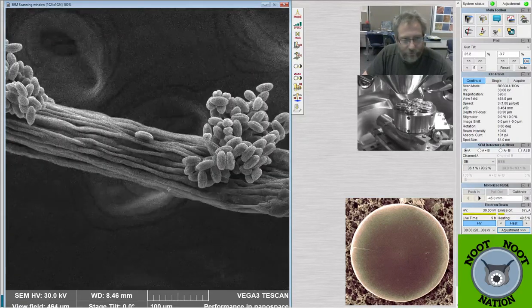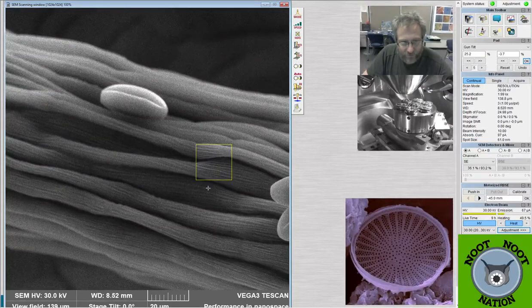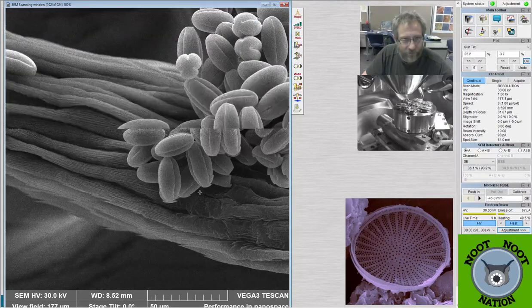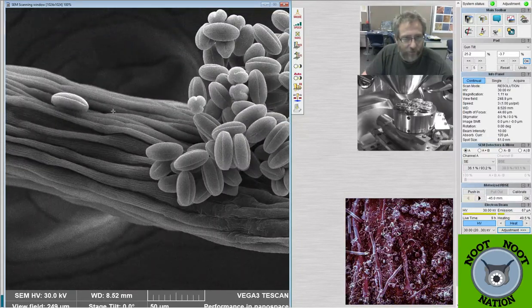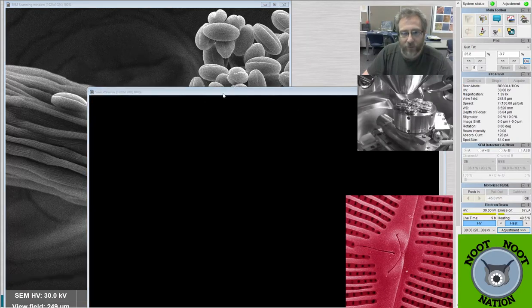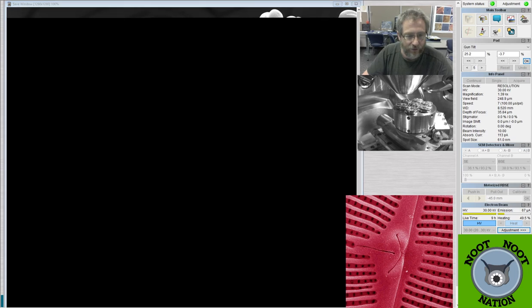The plant's pretty cool. It looks like cabling, right? Like if we look really close at it, it looks like it's kind of cables. And then the pollen on there gives it a kind of an interesting texture. So I just want to do a little photography, compose it, but also you can see some of these pollen grains where you can see them end on and some on the side, which is nice for trying to document what it looks like in three dimensions. So I'm going to go ahead and take another picture. The pictures take about 3 minutes in order for it to scan across the image.